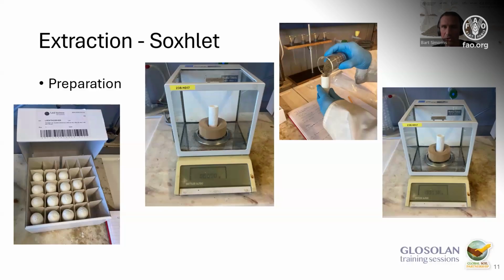So what I have prepared now are a couple of slides to show how a Soxhlet extraction works and how the mechanical shaker works. I absolutely don't mind running through the slides and explaining what's on them, but if that is the 5th time that it is shown this week, just warn me and then we'll skip to the next part. It's probably the same for every procedure that requires the use of the Soxhlet tool.